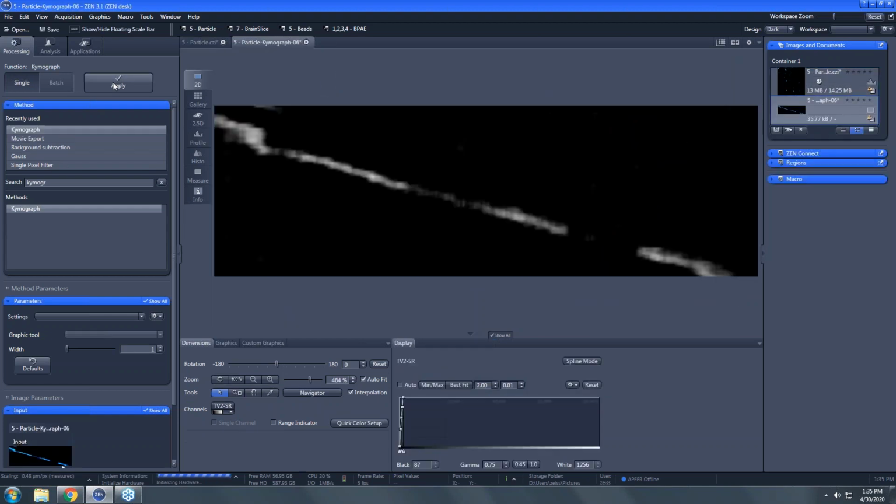Terrific. So we've got an image that represents the movement of this particle. What you're seeing is a displacement versus intensity image. So the x-axis is displacement. So it's actually moving along the profile that Nicole drew. And the y-axis is the individual profiles. So you're seeing the intensity of each line, each row of this image is a different time point.